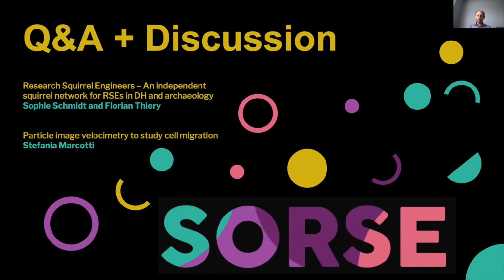I had a question about performance and what is normal. You showed an example there running over 9 frames. If you were working with a video like this normally, what sort of frame rate would you expect, and how many frames would you normally have to analyze to get some kind of useful results?